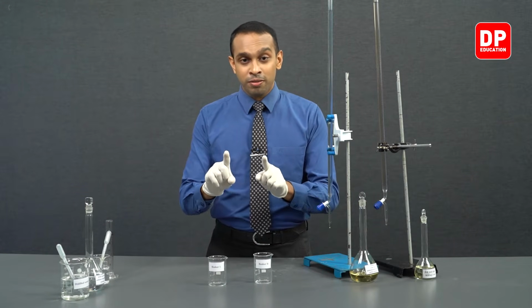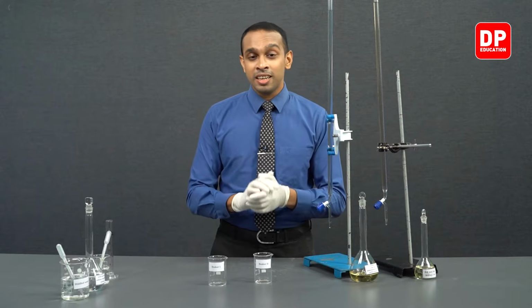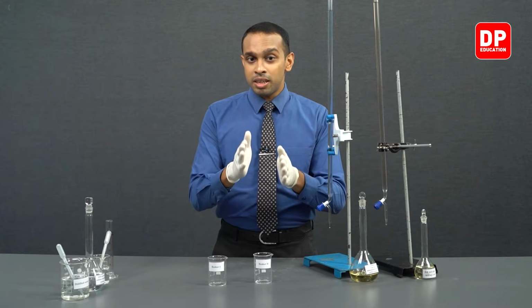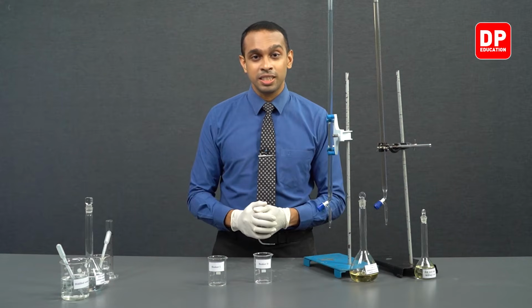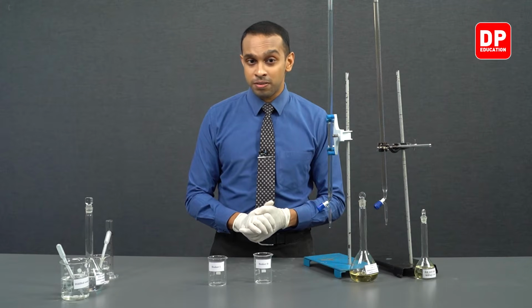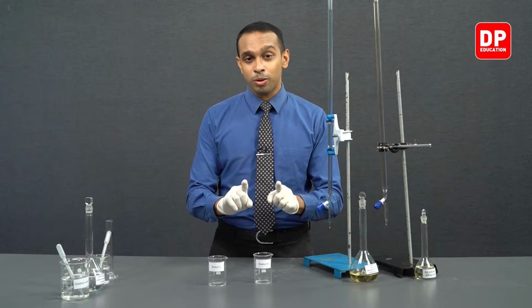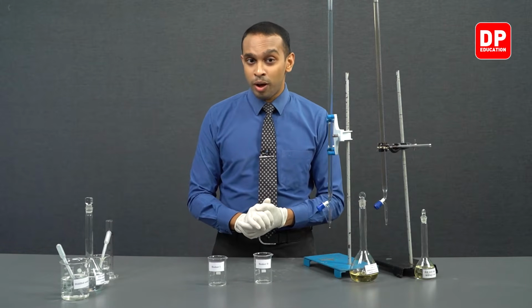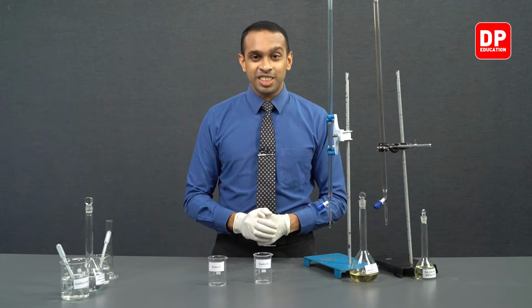So sodium thiosulfate in the medium will delay this color change, and it will also make sure that a certain amount of iodine is produced before we observe the color change. So this helps us to measure the time taken for a very specific amount of iodine to be produced. So since the amount of sodium thiosulfate in the medium does not change from reaction to reaction, we are always going to end up producing the same amount of iodine before a color change is observed.